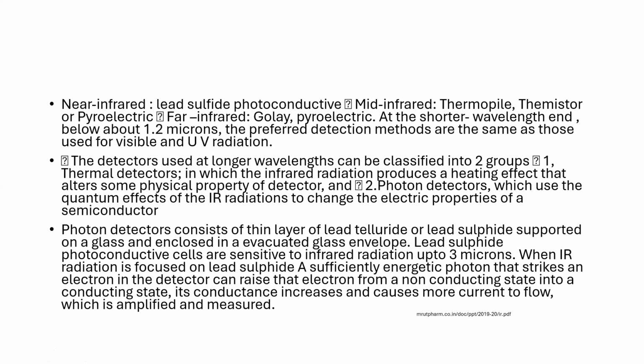So it will absorb the signal generated by the instrument, by the sample. If the signal is poor, you need amplifiers like a photomultiplier tube, which will multiply the light signal received so that it can be detected by the instrument. Initially it is connected to the photoconductive cell, which is lead sulfide, and photoconductive means it is allowing the light to come, it is not stopping it.